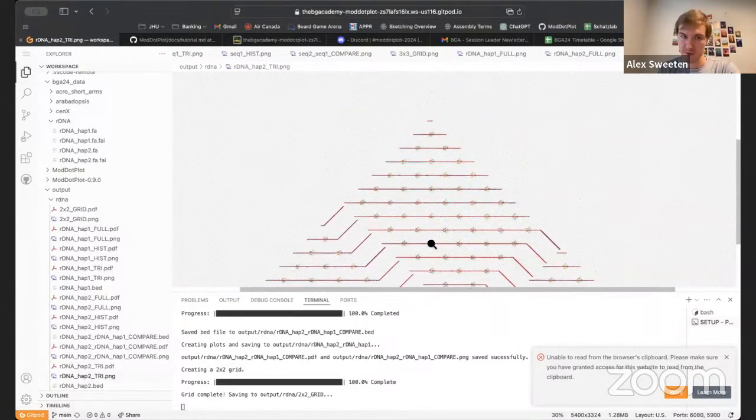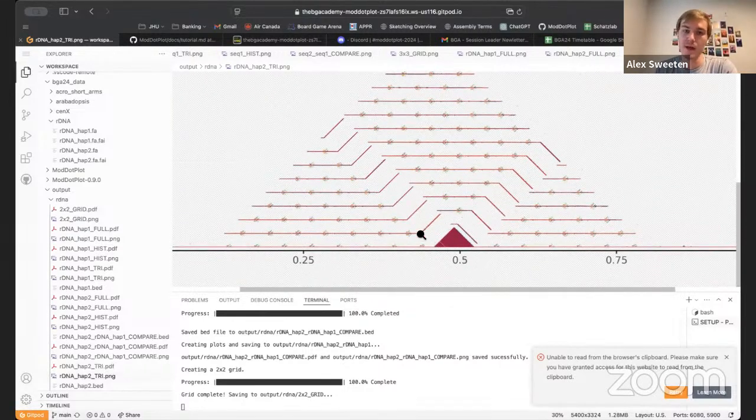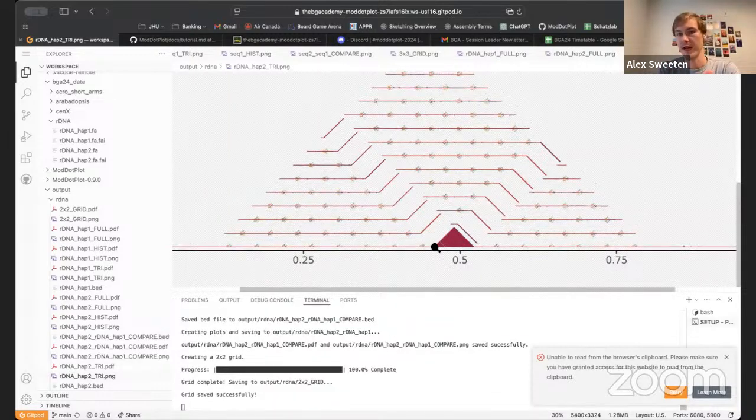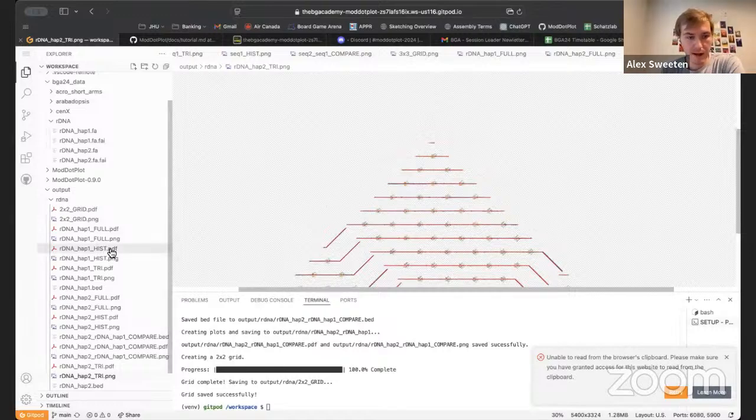So this is likely what happened with this haplotype, is that this was just assembled incorrectly. You have this satellite kind of messing things up. Likely this isn't a real satellite. Likely it's just a repeat region that the auto assembly method, in your assembly graph, just assumed was the same sequence repeating over and over and over again. And that's what leads to this satellite class here. So yeah, this is an assembly error. We can see that haplotype 1 doesn't have that, but haplotype 2 does.